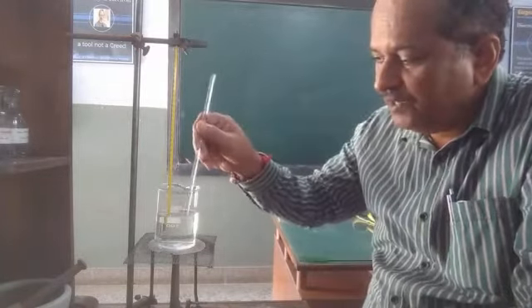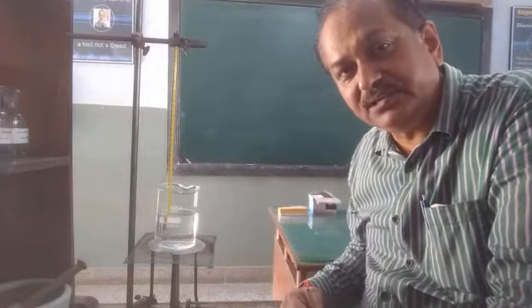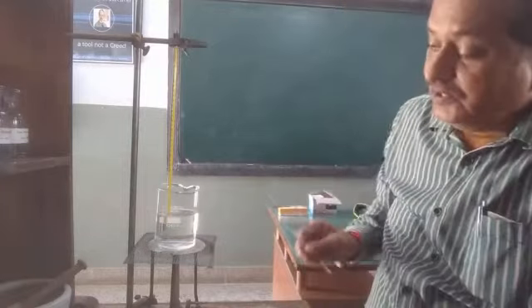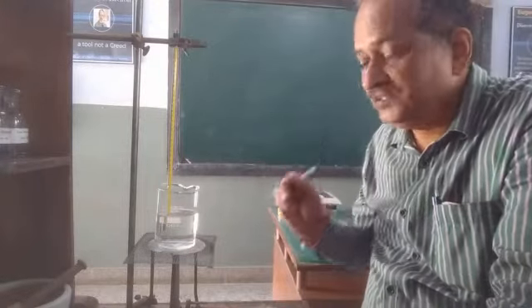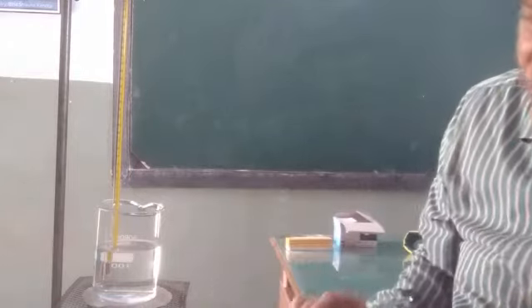So we rotate like this. Now see carefully. The thermometer bulb is here, just in the center of the beaker. Why is it in the center of the beaker? Because if it is in the bottom portion, it can be damaged. It can be damaged, and so as a result, we have it like this.